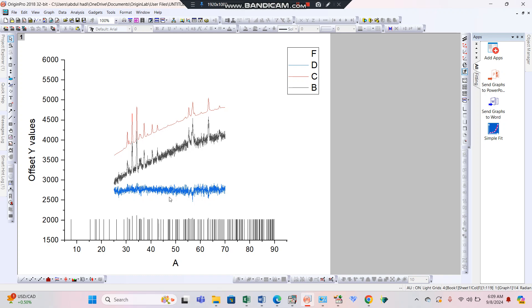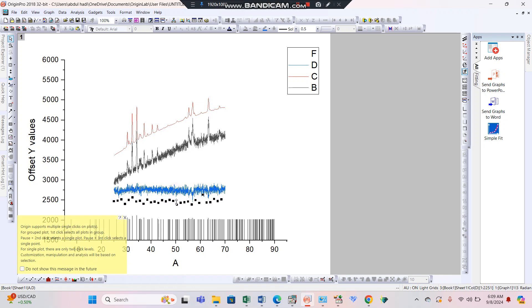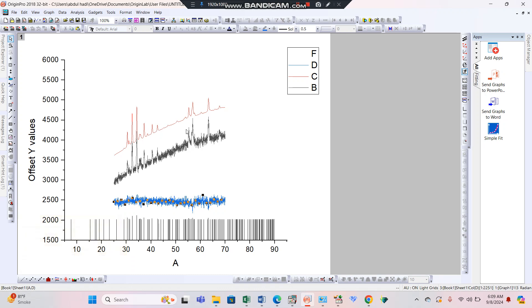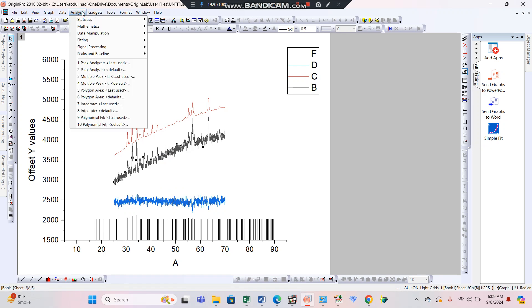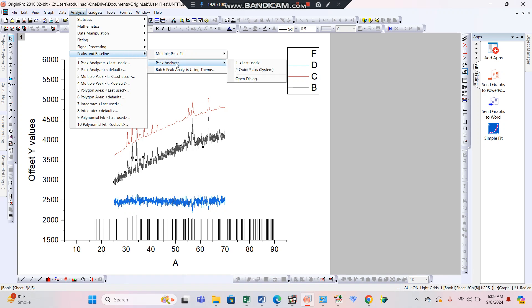This is the difference, so you can place it here. You can see that the I-observed and I-calculated are not straight and the baseline is not fitted. To fit the baseline, select the I-observed data, go to Analysis, and choose Peak and Baseline.